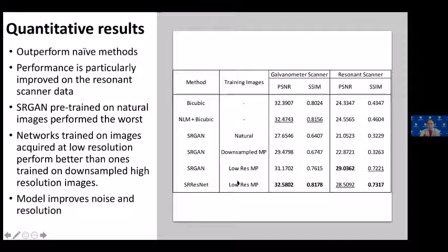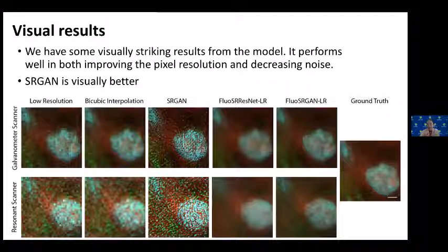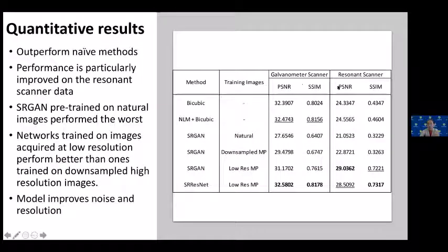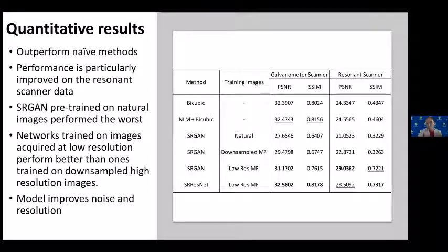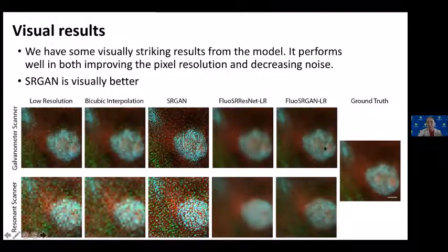So one thing you may notice is that the bolded ones are the highest performing ones, and the SR ResNet actually outperformed the SR-GAN here, which is actually not surprising considering what metrics we use here. So this one you can see visually is more smooth and less noisy, but it doesn't have the details or the similar look as what the ground truth data is. But with those measurements, we cannot have a very good metric to highlight these differences here.